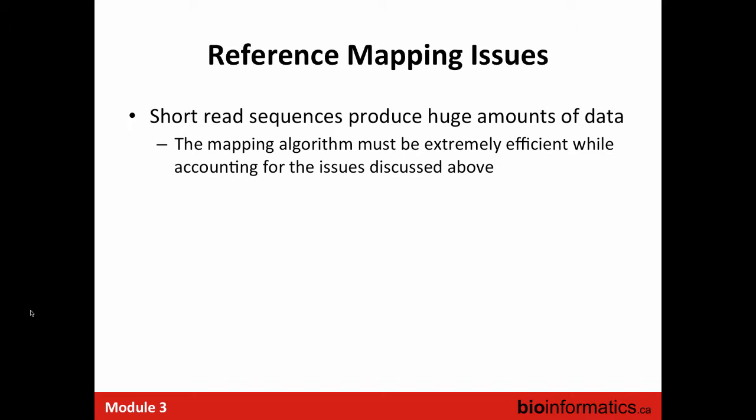Would you still trust BWA to map nanopore reads compared to other mappers that are more specifically designed for them? Yes, that's a good point, and something I wanted to say on the last slide: you typically choose your mapping program depending on the type of sequencing technology. When we're mapping Illumina reads later on, we're going to use BWA MEM. When I map Oxford Nanopore reads, I also use BWA MEM, but with specific options designed to score them. You can just use the option -x ont2d. There are other specialized read mappers for nanopore data, like GraphMap, but I like to use BWA MEM.